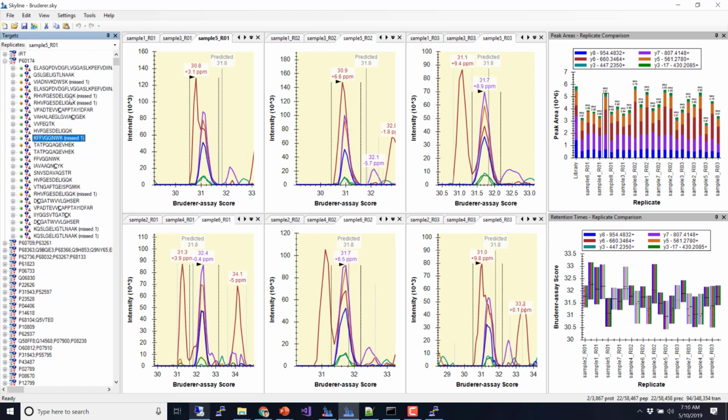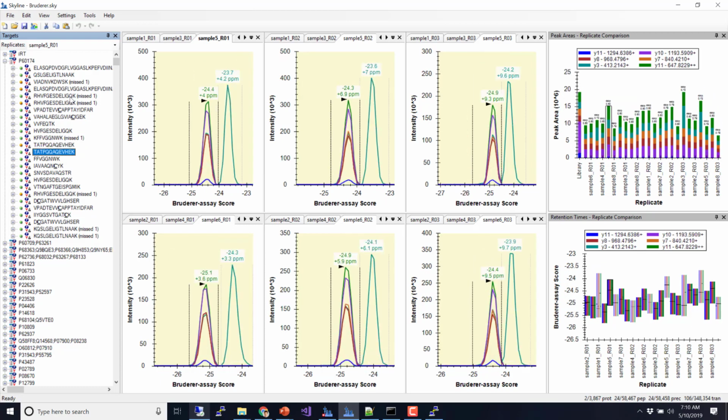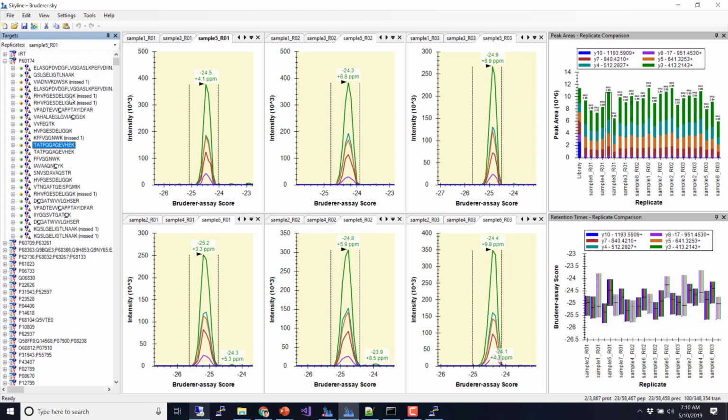With DIA, we can go, okay, we're going to get rid of this Y6, and we can look for other transitions that would be better for that peptide. We can keep trying transitions, because what we got them from is a fixed artifact. So it's just our choice. We chose these 6, and in a lot of cases, those 6 are doing great.